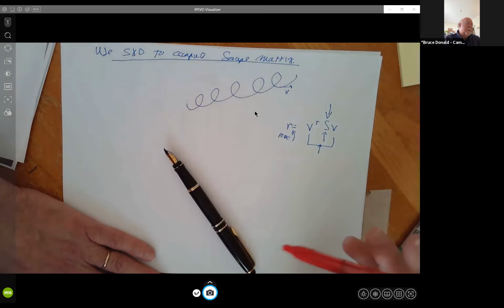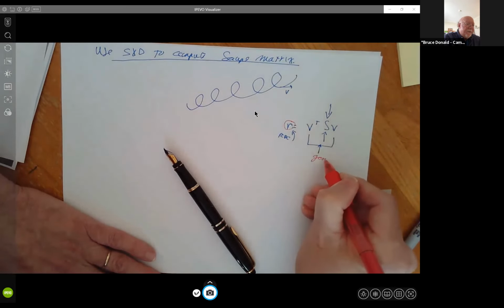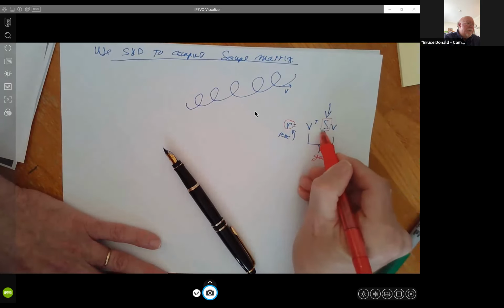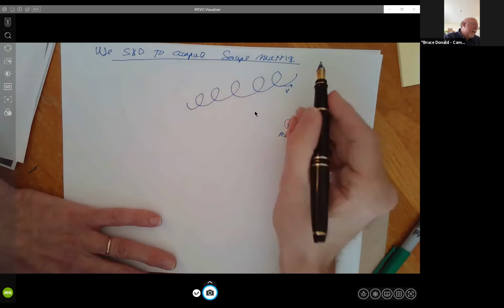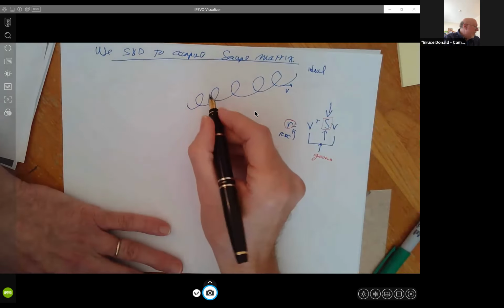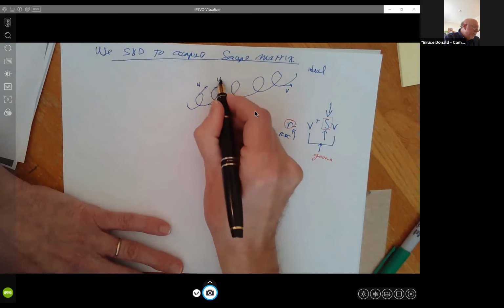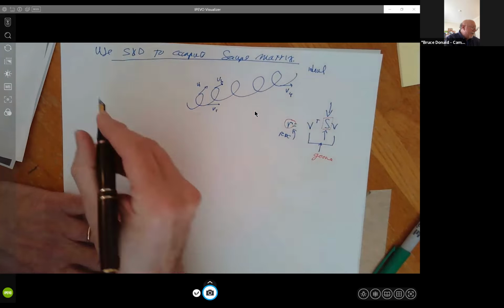What I've done in an actual experiment is I've measured R, and I want to recover the geometry here, which is the bond vector orientation. But without knowing S, that's rather difficult. So what I can do is I can use an ideal helix to bootstrap that. Once I have bootstrapped and I know something about S, then I can start to approximate these vectors. So the idea is I take an ideal helix like this, or I could use a homology model like this. And from the ideal helix, I have various bond vector orientations, which I'll represent like this. So here I'll have V1, V2, V3, V4. Just take it from the ideal helix model like this. And then I have a sequence.